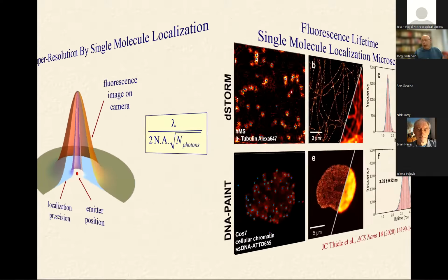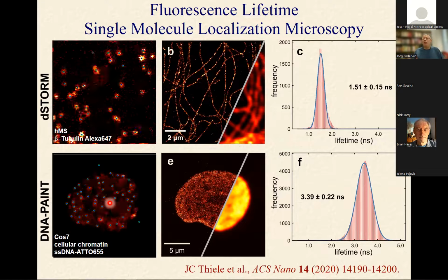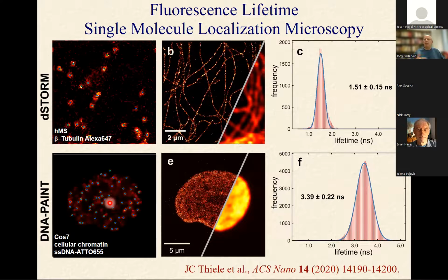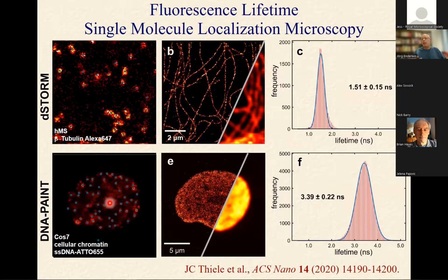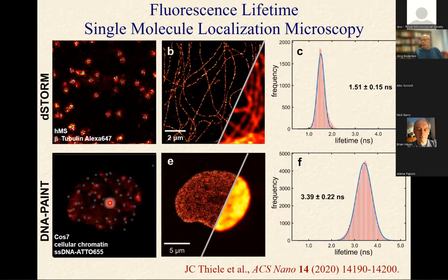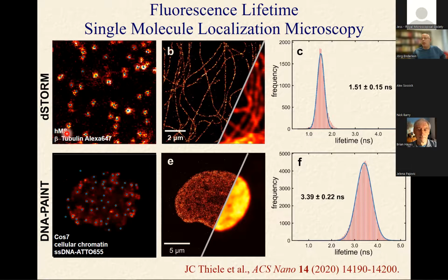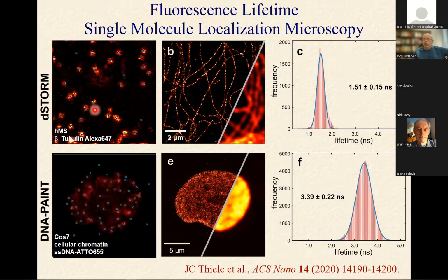So what we did here now is, it looks like a standard single molecule localization microscopy experiment, but it is not, because what we do here is we use our very rapid scanning system for taking, in very rapid succession, scan images. And then we treat these scan images as if they would come from a normal wide field microscope in a normal STORM or PALM experiment. So the difference here is, this is not a wide field image, what you see in this movie; these are scan images. But still, in these scan images, we can localize individual molecules. We can fit their center position with very high accuracy.